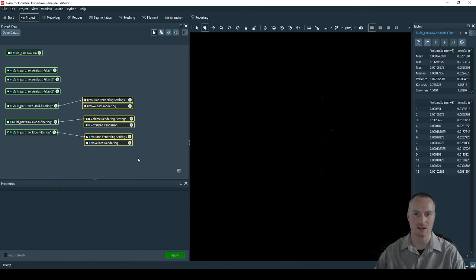The recipes are an easy method for creating a very quick analysis in Avizo for looking at multiple components. These can also be combined with the watchdog routine for automatically analysing large volumes of CT data.